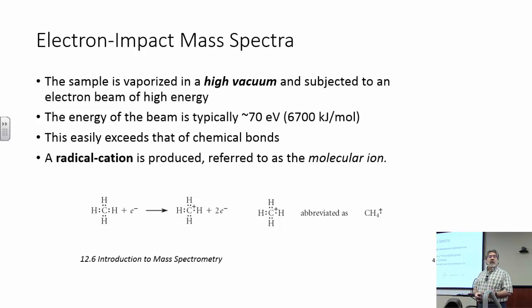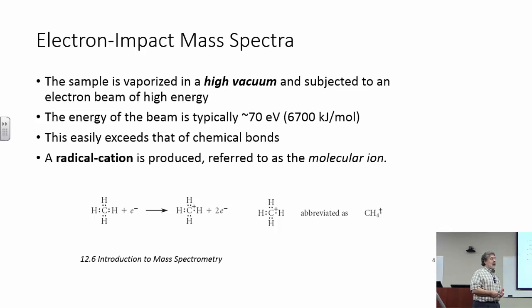And that's accomplished two ways. One, the really high vacuum, and two, the injection port is usually at about 200 degrees C, and that will vaporize just about anything.